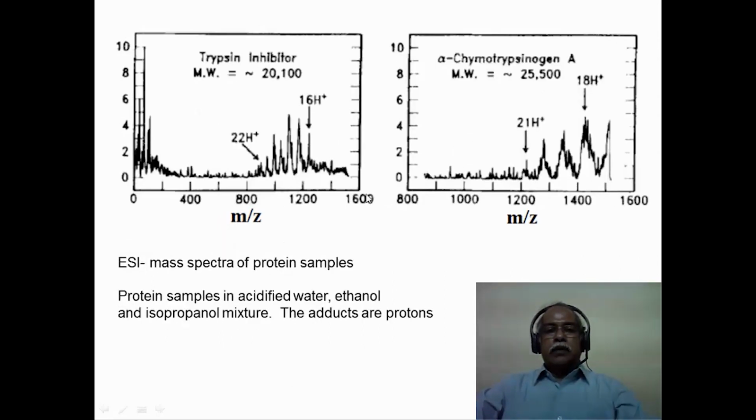Now let us go into some proteins and polypeptide samples. Electrospray ionization of protein samples.